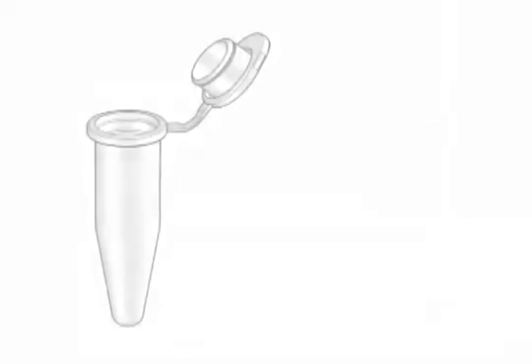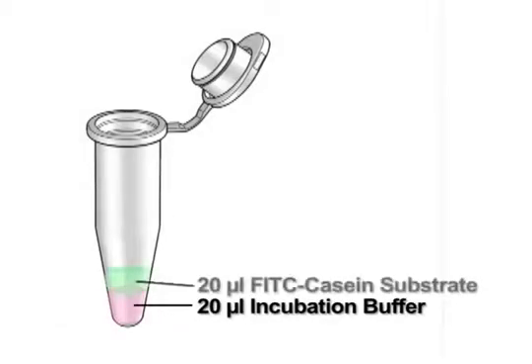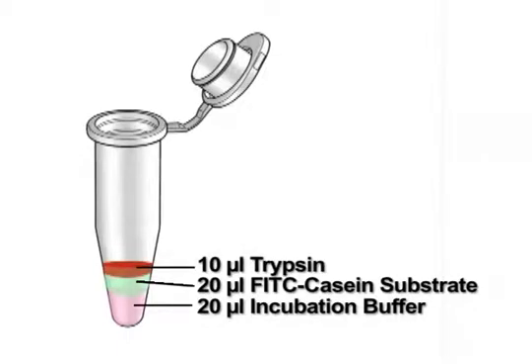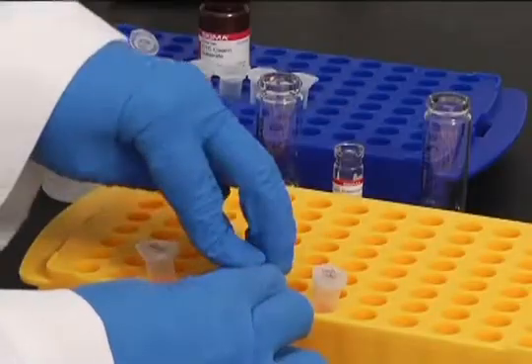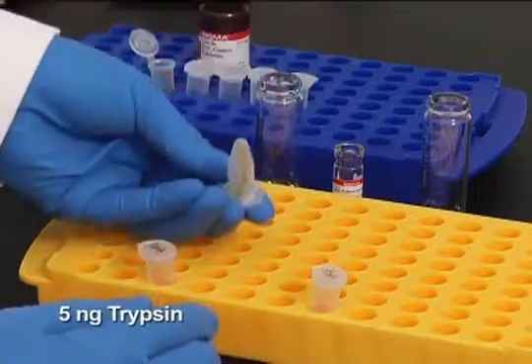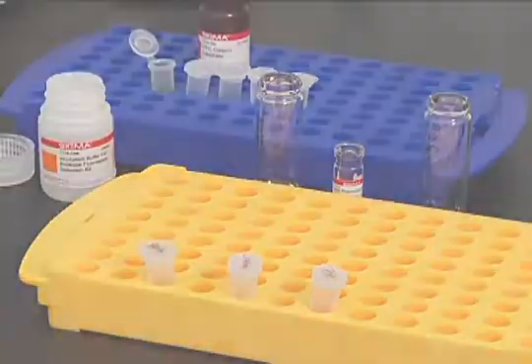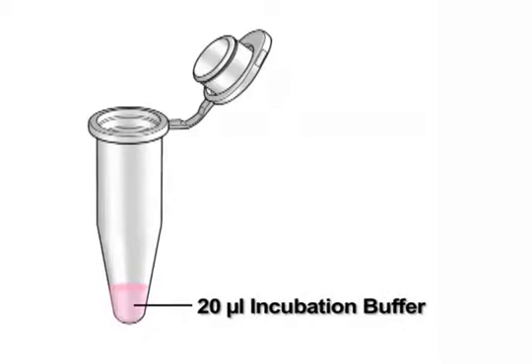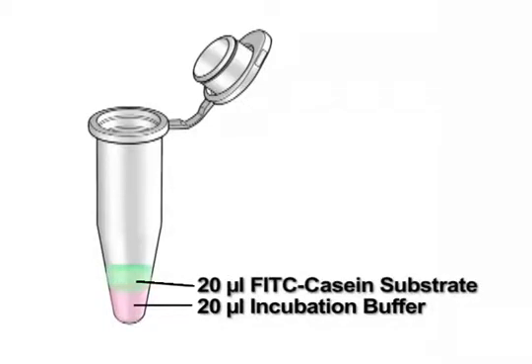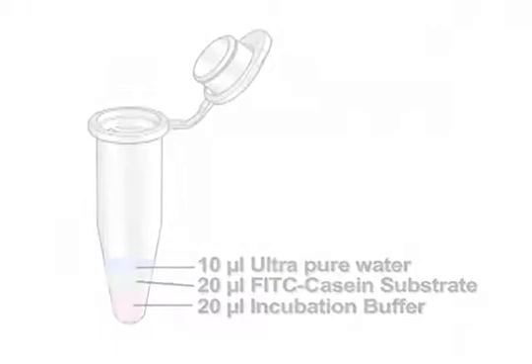Continue to prepare the control sample by combining 20 microliters of incubation buffer, 20 microliters of FITC casein substrate, and 10 microliters of the trypsin control in a microcentrifuge tube. It is recommended to run at least one control sample of 5 nanograms trypsin with each assay, or to use serial dilution. The last sample is the blank, prepared by combining 20 microliters of incubation buffer, 20 microliters of the FITC casein substrate, and 10 microliters of ultra-pure water in a microcentrifuge tube.